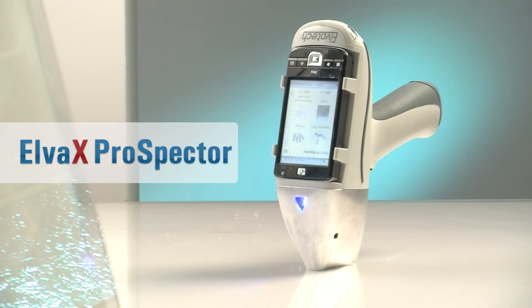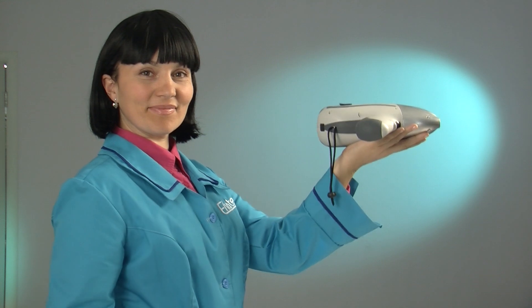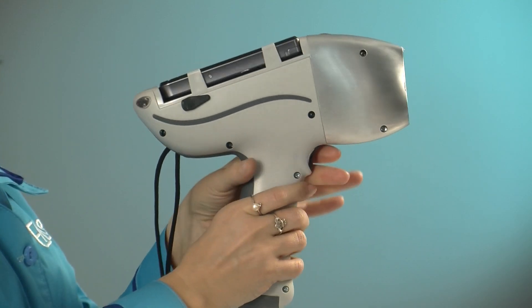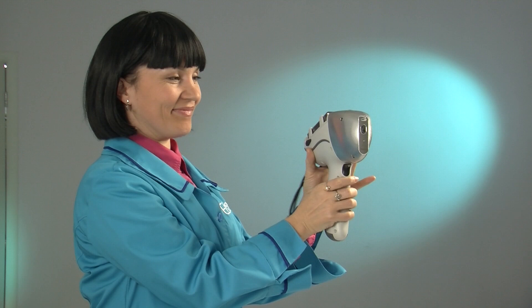Elvax Prospector handheld spectrometer is a full-blown chemical laboratory that fits conveniently into your hand. Elvax Prospector is a safe, reliable solution for on-site chemical analysis without sampling.